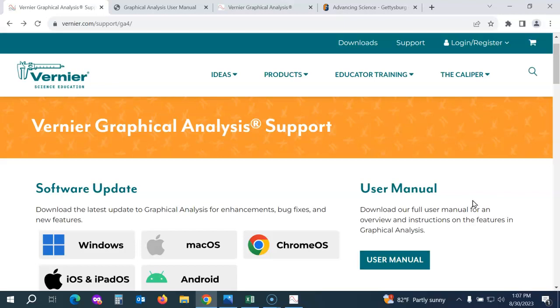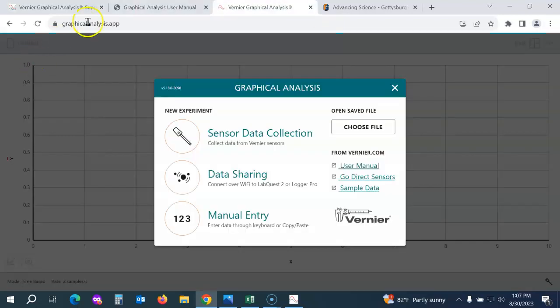If you don't have the ability to download the app on student devices, or if you're only going to use the Vernier probes a couple of times a year, you can use the free web app. The URL is graphicalanalysis.app. We recommend posting that link on your classroom management website so students can click directly into it. We do recommend using a Chrome browser to access that app.